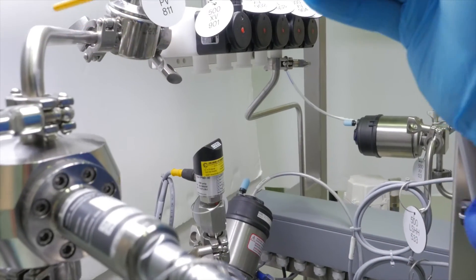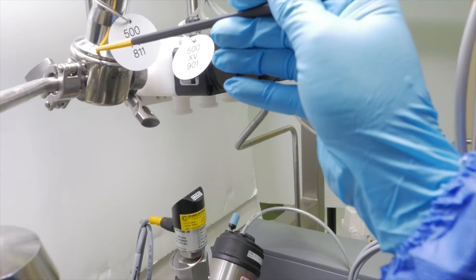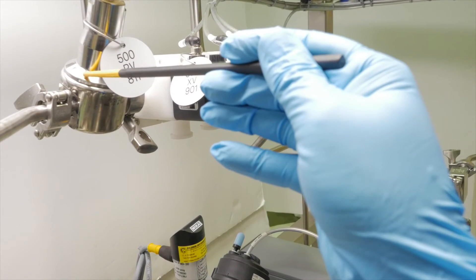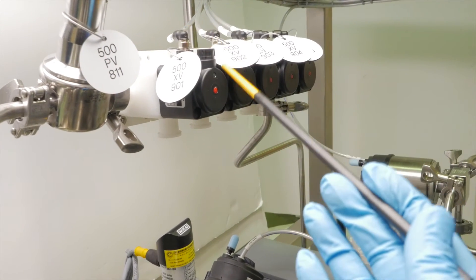Optional column outlet pressure control can be added to the system to maintain constant pressure across the column and prevent off-gassing.